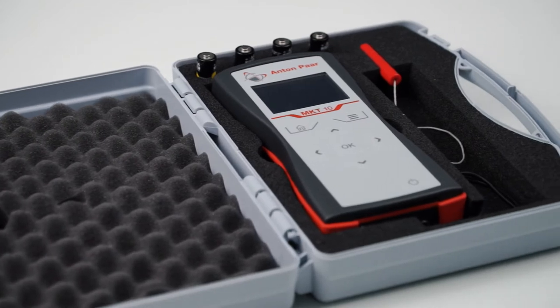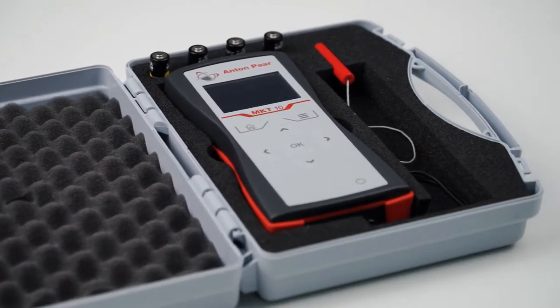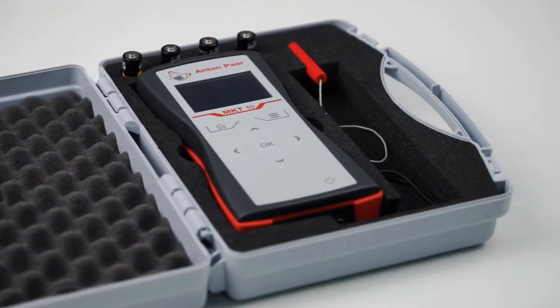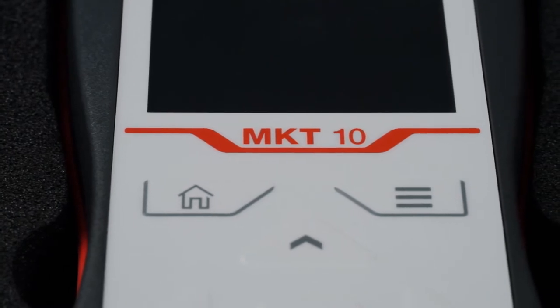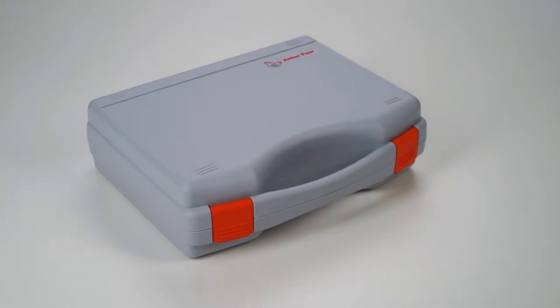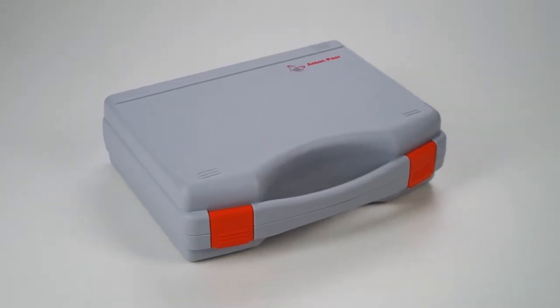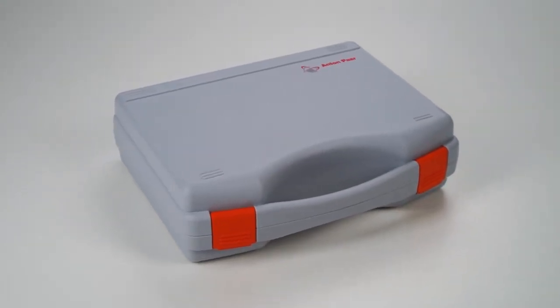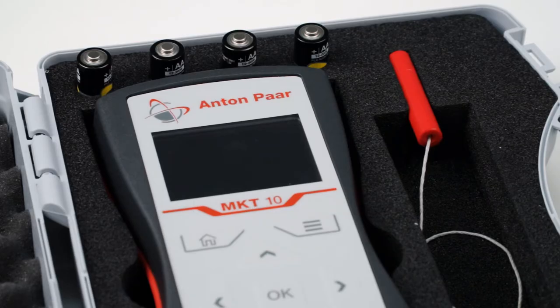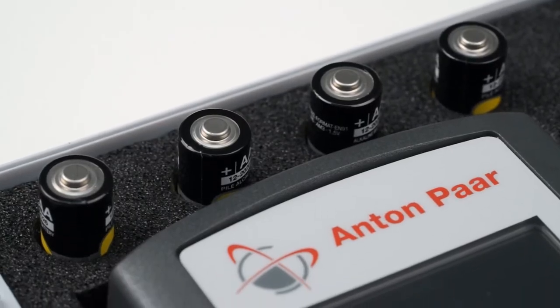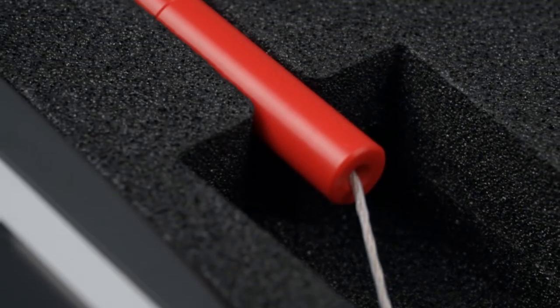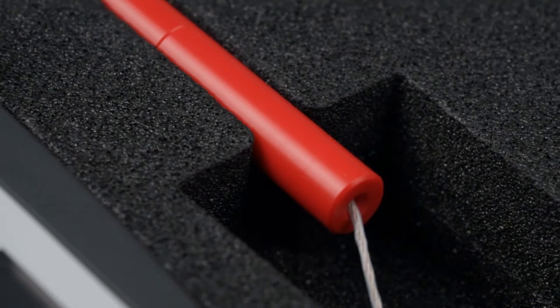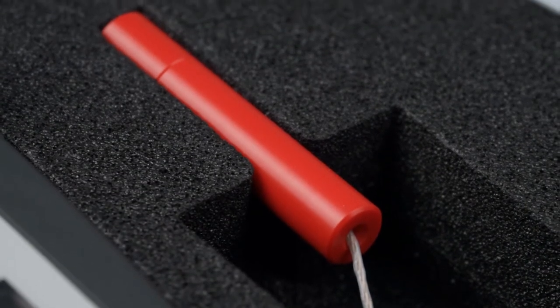MKT-10 is a small and lightweight handheld millikelvin thermometer developed by Anton Parr. MKT-10 comes in a shockproof case which holds the device itself, four AA batteries, and a small red cylinder shaped cover to safely store the high precision sensor.